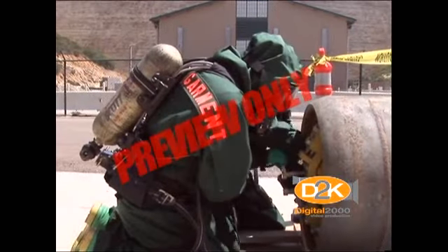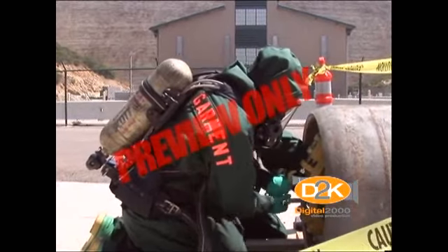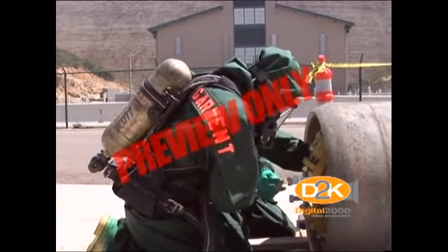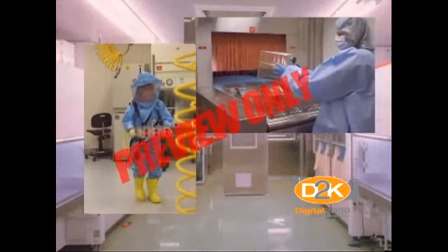Biosafety Level 3 and Biosafety Level 4 require special facilities which use agents that have a high risk of causing life-threatening disease. These agents require partial to complete isolation.